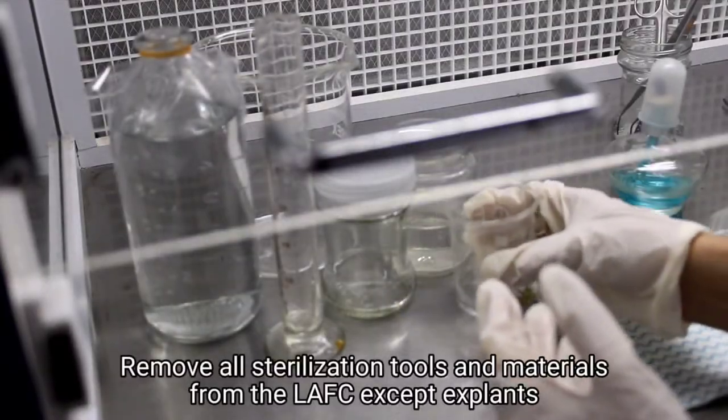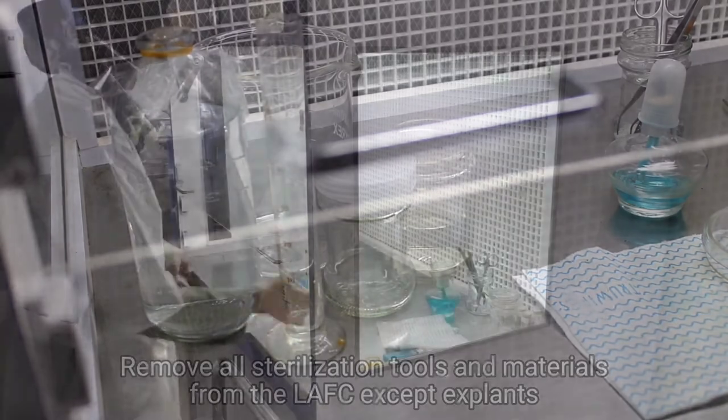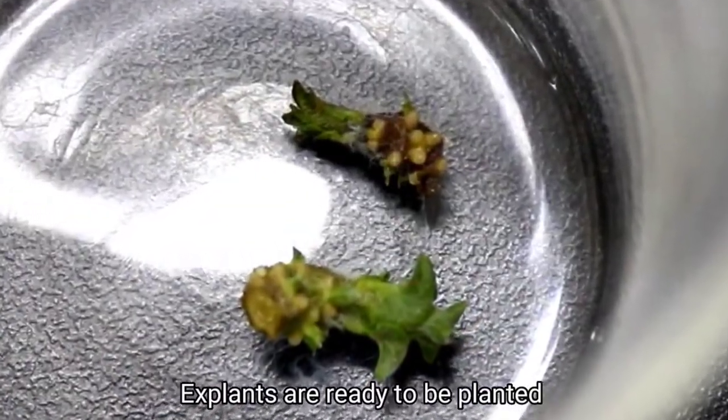Remove all sterilization tools and materials from the LAFC except explants. Spray LAFC again with 70% alcohol before inoculating the explants. Explants are ready to be planted.